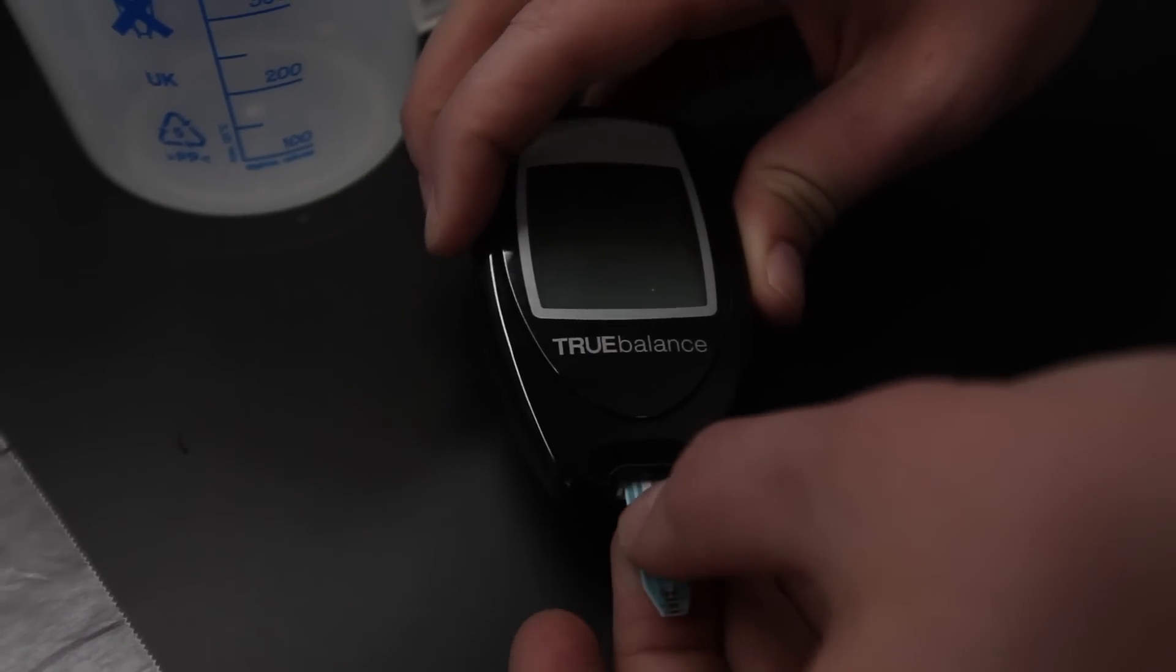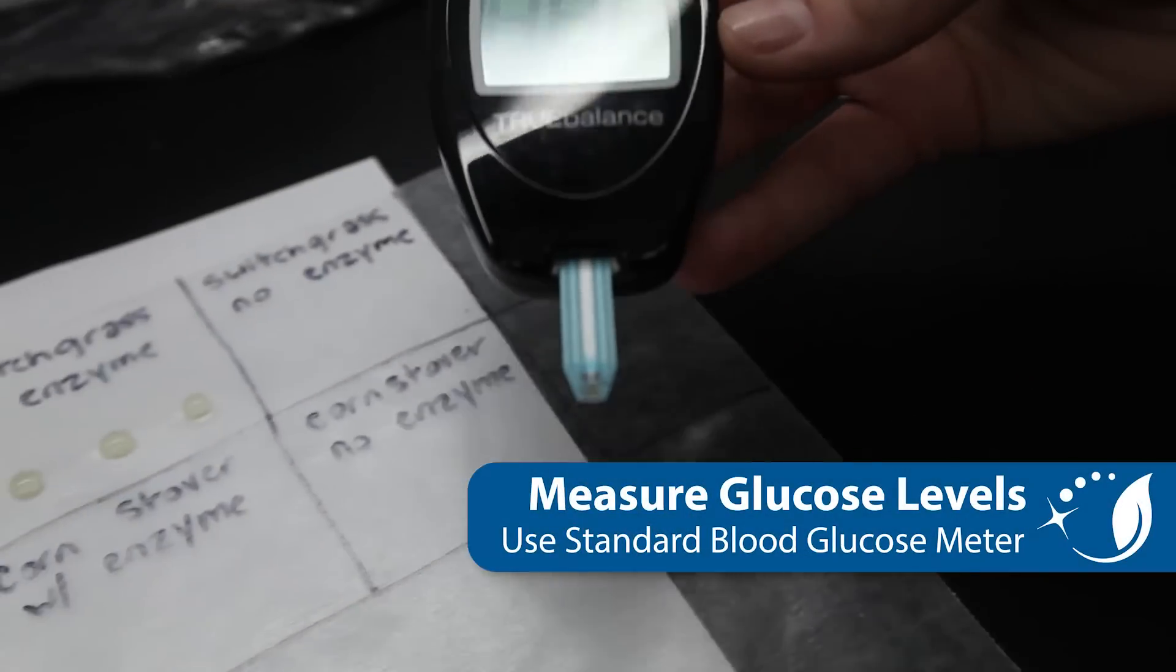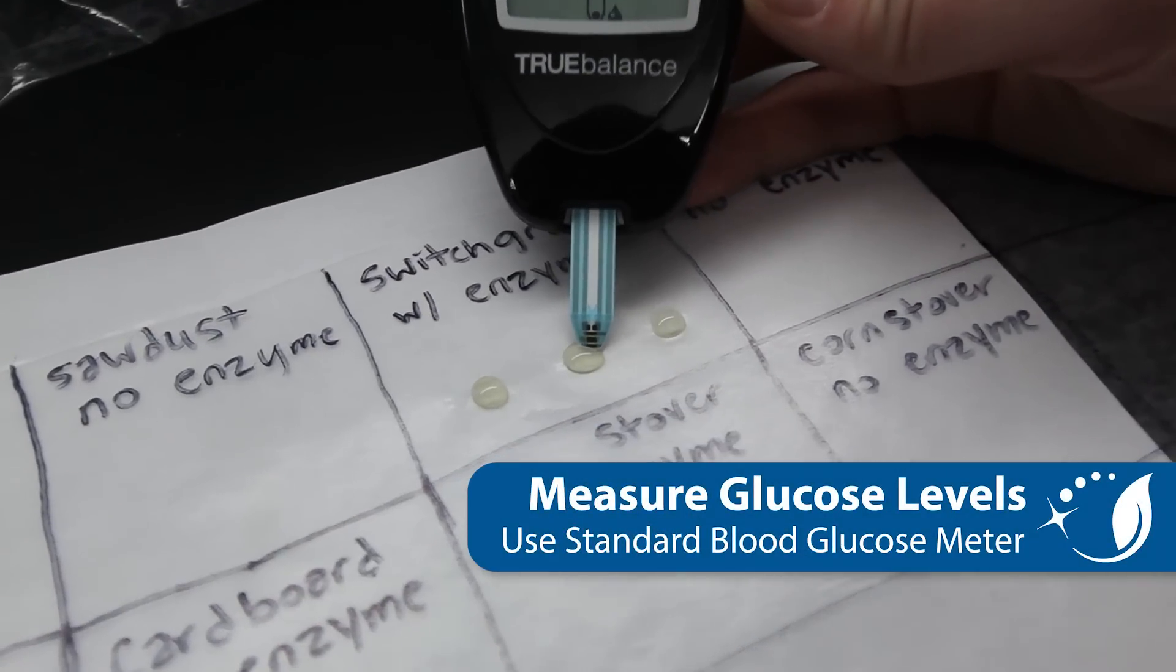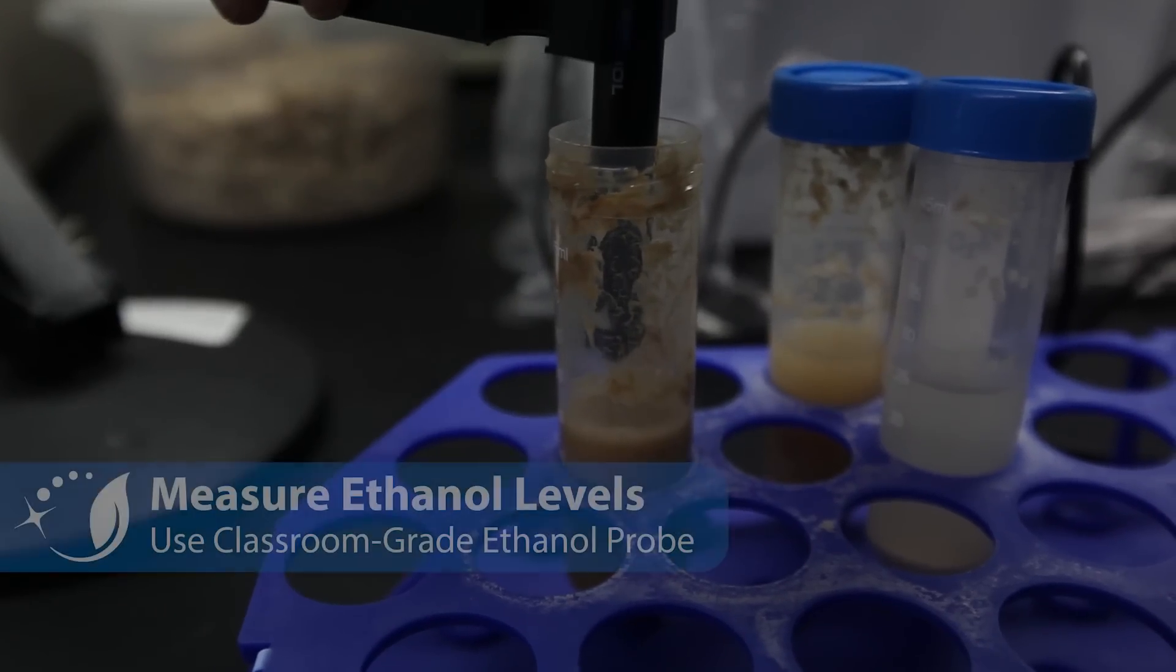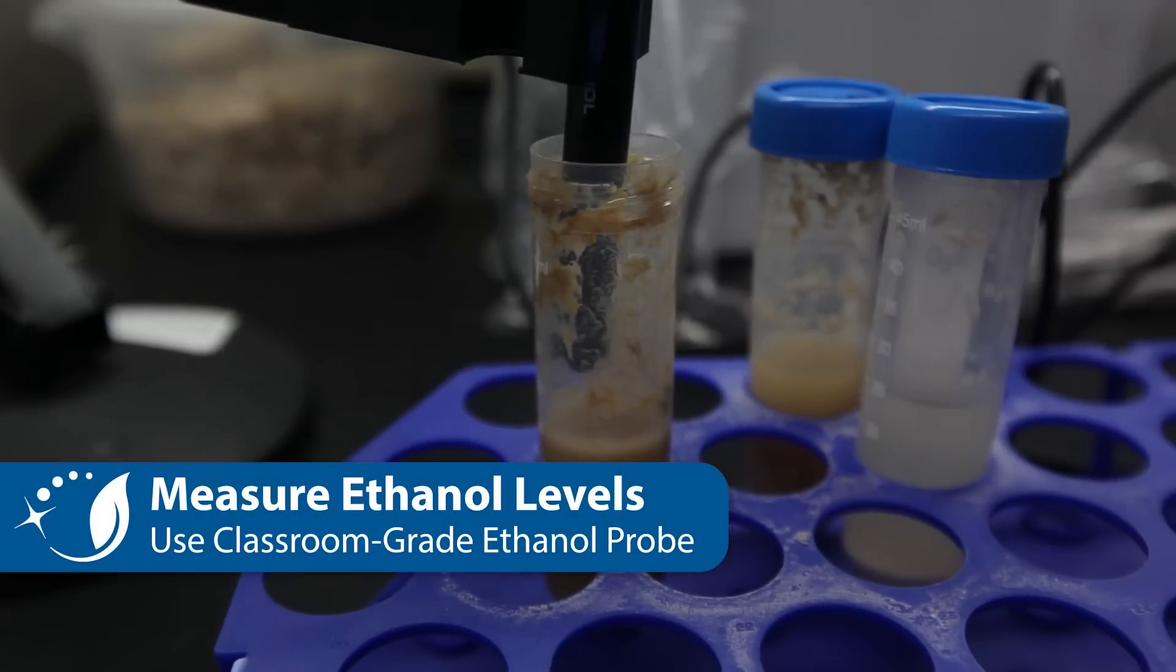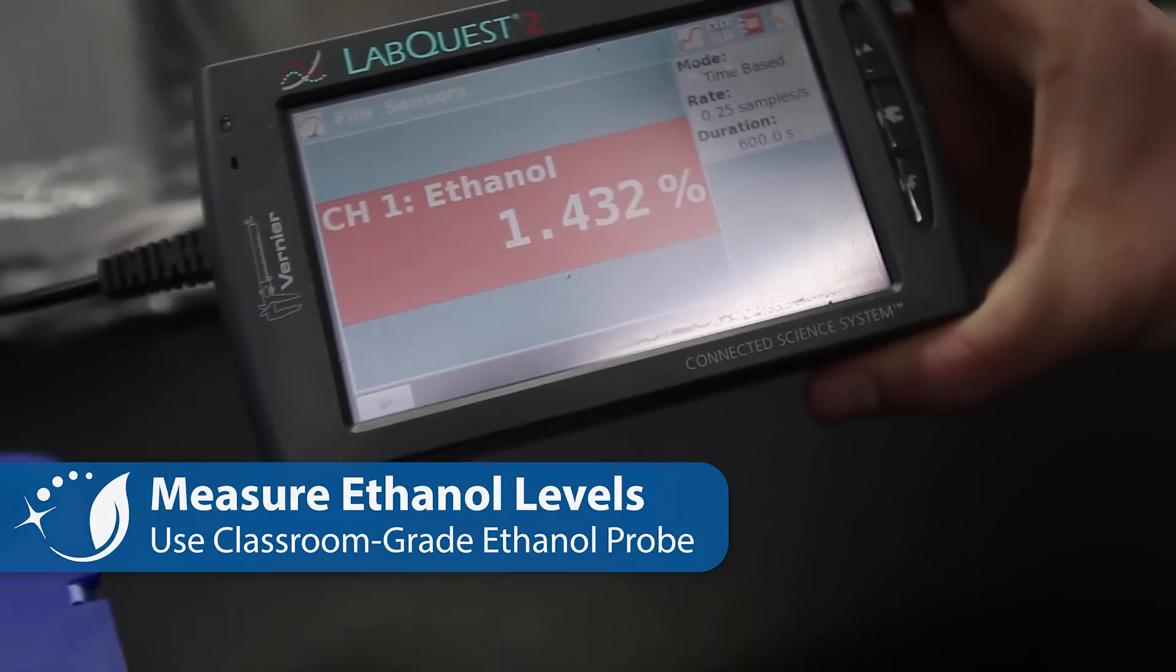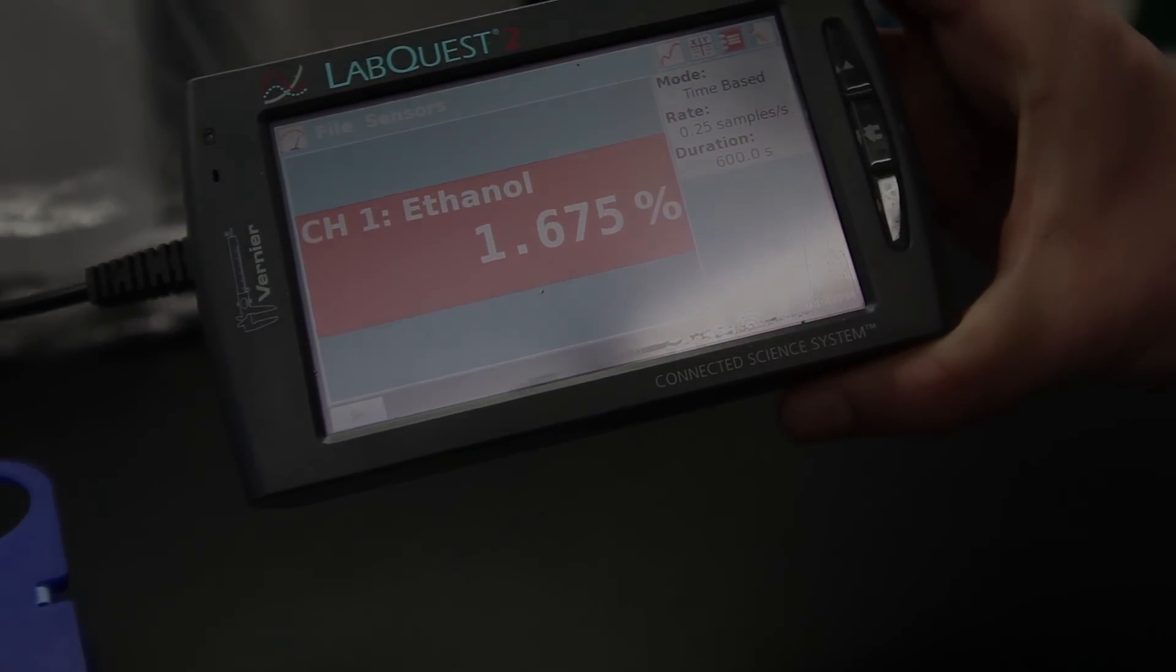Before and after each stage in the process, it is important to take glucose and ethanol measurements. A standard blood glucose meter and classroom grade ethanol probe will work well. This will help you track the matter and energy transformations across the entire process. The goal of the lab is to chart how various types of biomass and pre-treatment techniques influence the amount of ethanol produced.